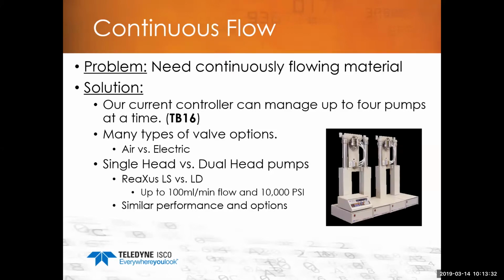But if you need continuously flowing material, typically you're either going to want two pumps working in synchronization, or a pump that has two heads in synchronization. Okay, so that's the simple solution there. That's not really a problem, but it's a concern or a question. You can also use two different pumps if you so choose, but in most cases the more cost-effective path is to go to one of the two that we just spoke about.